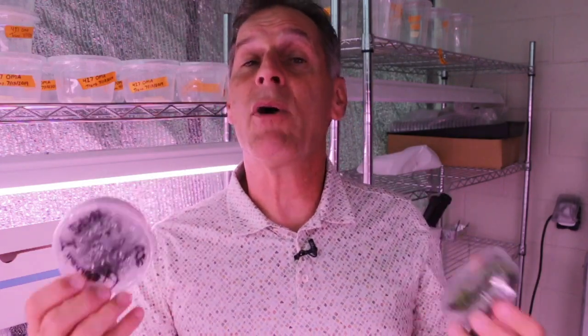With orchid seeds, I've been working with these for a while — I'm learning as I go, figuring things out. What I do is plate these on various media, go to the literature to see what other people are doing, talk to people, but also evaluate various treatments very carefully. Today I want to tell you a little bit about orchid seeds and share a story about how I evaluated some conditions for germination that a lot of people use but may not be necessary.